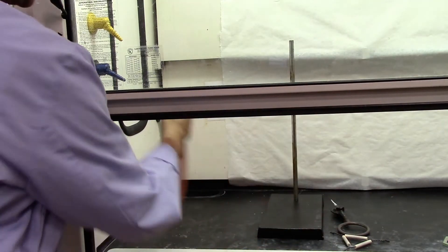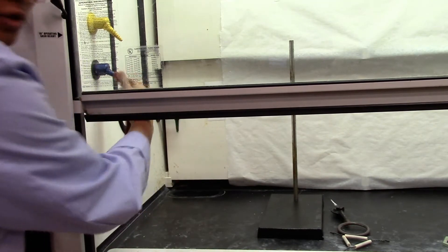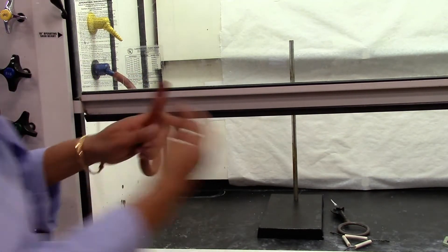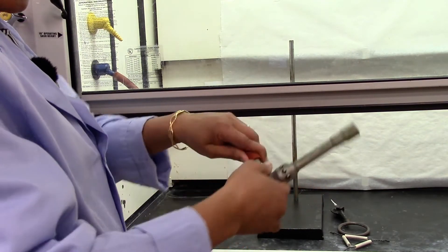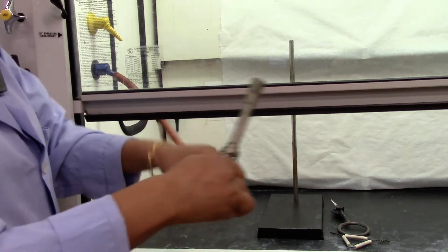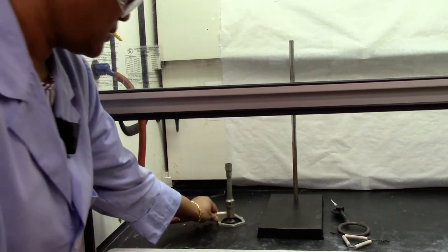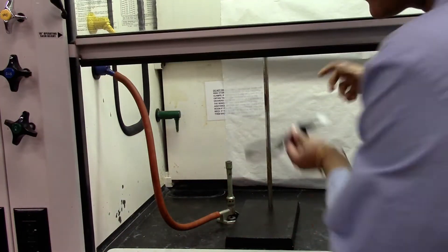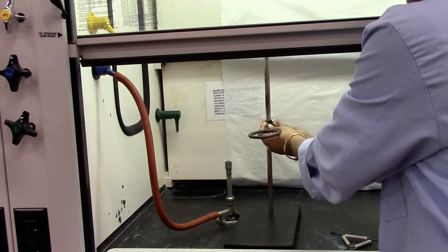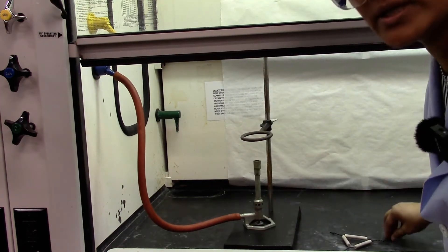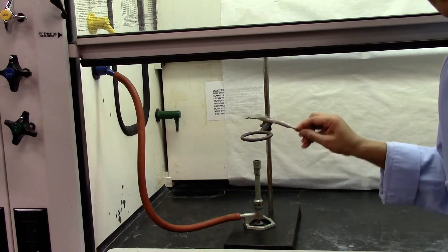I'm going to connect the tubing to the gas line which is blue in this hood and then connect this with my Bunsen burner and I'm going to clamp a ring stand. Place it underneath and I'm going to put a clay triangle on top.